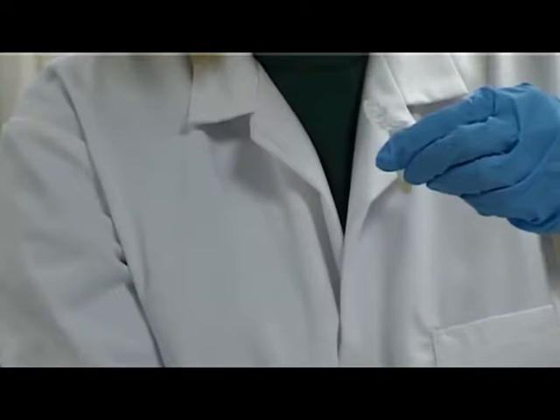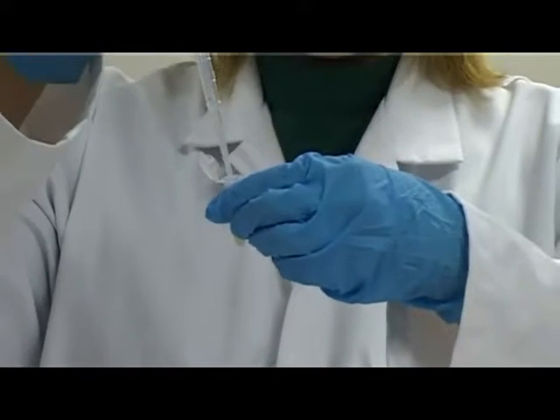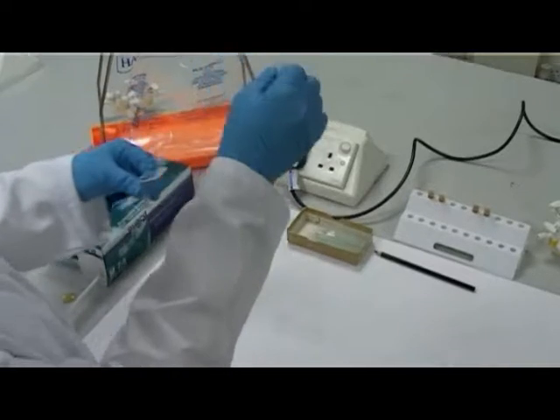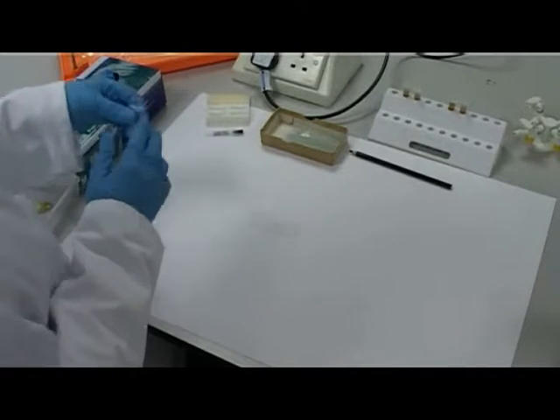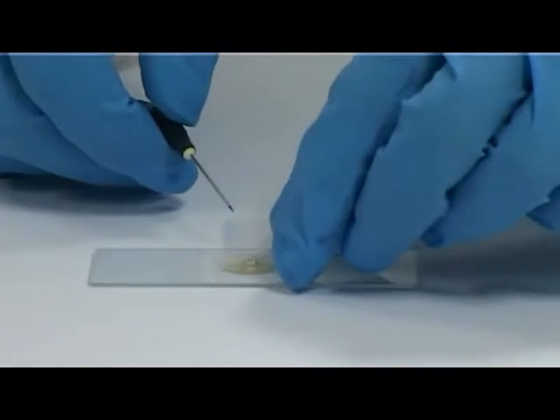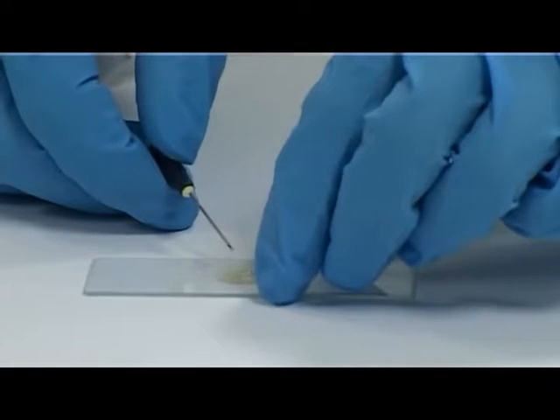Pipette up a small amount of the remaining supernatant and sediment. Place one drop onto the microscope slide. Carefully place a cover slip over the sample avoiding air bubbles. You can use a needle to do this.